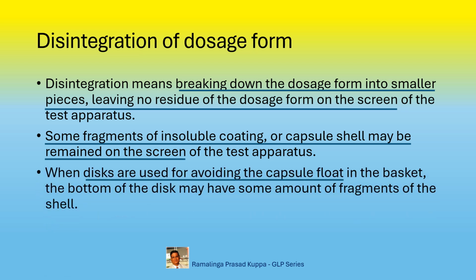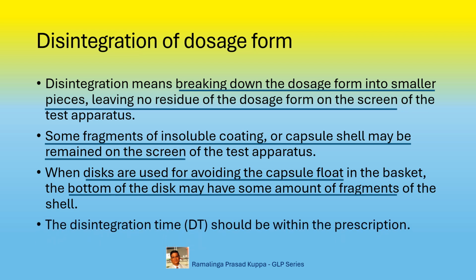When discs are used for avoiding the capsule floating in the basket, the bottom of the disc may have some amount of fragments of the shell. This also is possible. Sometimes, when the disc is used to prevent floating of the tablet or capsule, some amount of shell fragments may be left over on the screen. The disintegration time, DT, should be within the prescription. The test is considered passed when the disintegration time is within the specifications.